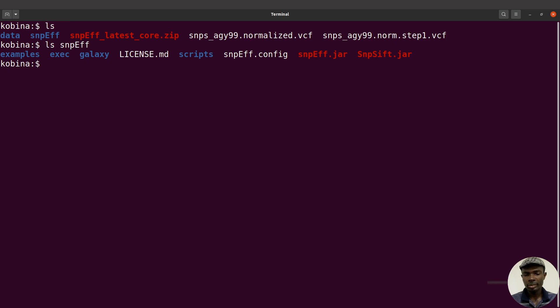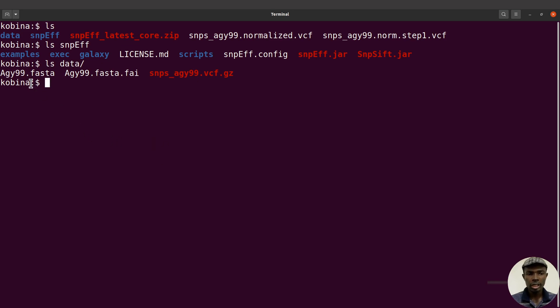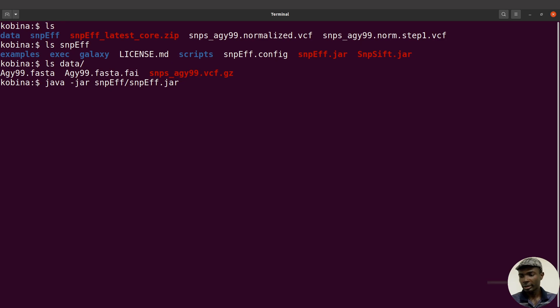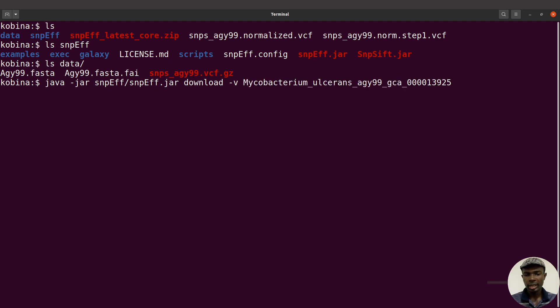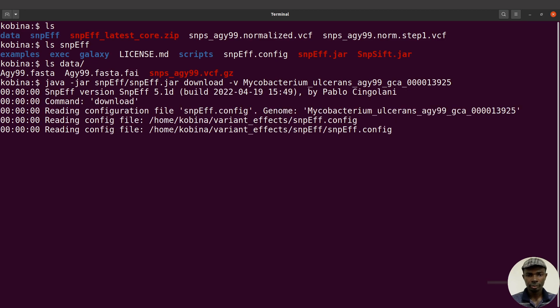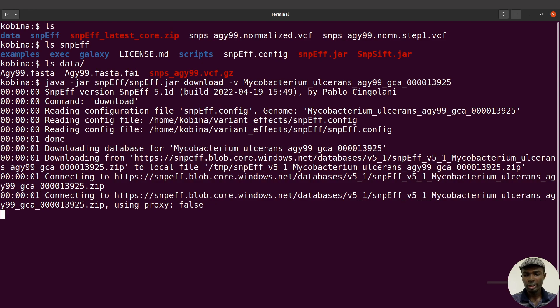What we are going to do is download the database of interest — in this case the AGY99 database. To download the database in SnpEff, we say: java -jar, then supply the name of the database, which in this case is the AGY99 database name we copied. Now let's execute this command. SnpEff will download the database and configure everything — let's wait for it to complete.